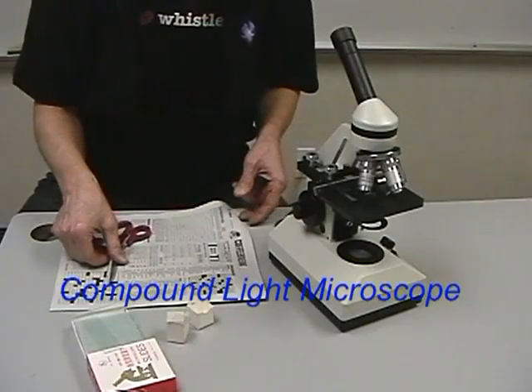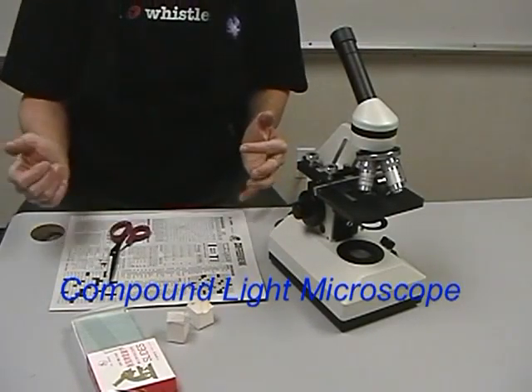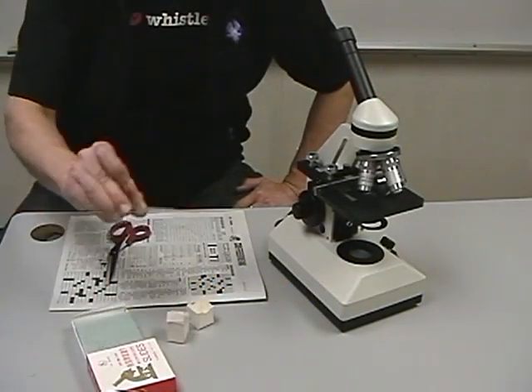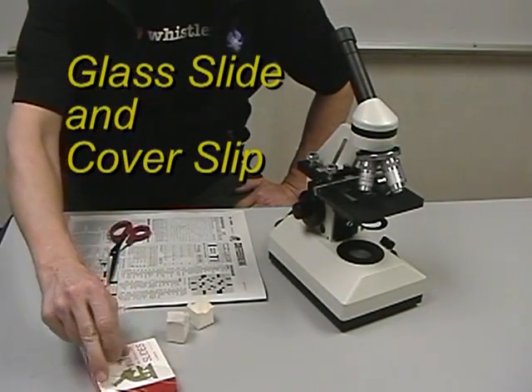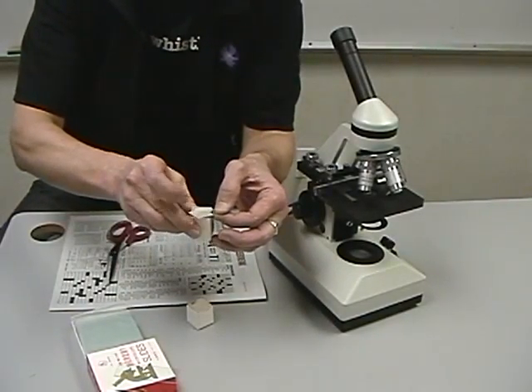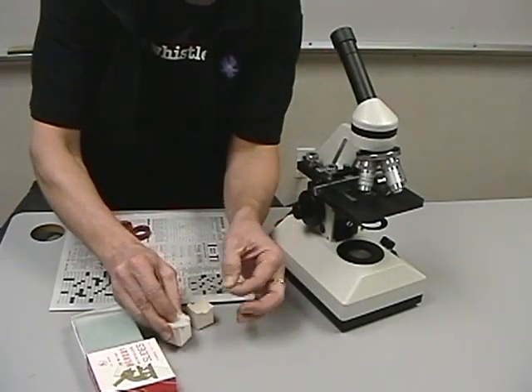We're going to be looking at an observation of letter E from the newspaper using the compound light microscope. We need to have a clean glass slide. Got one fresh from this box. We need to have a cover slip. This is a clean one, right fresh from this box. Hard to see perhaps, but there it is.